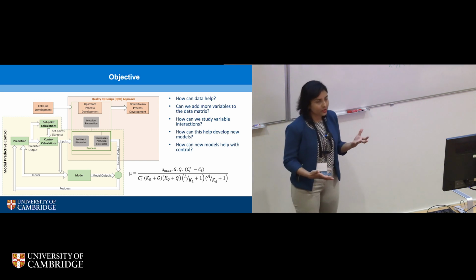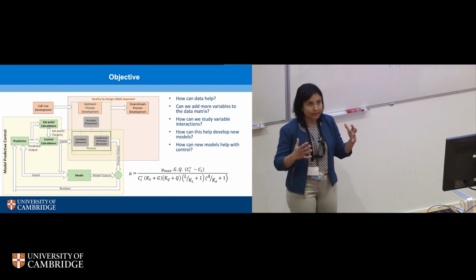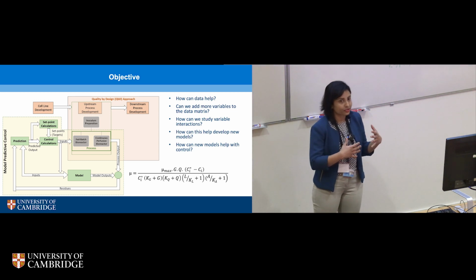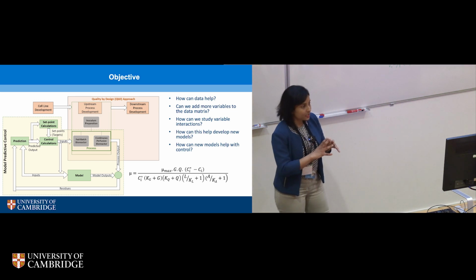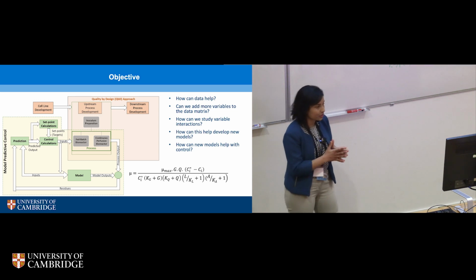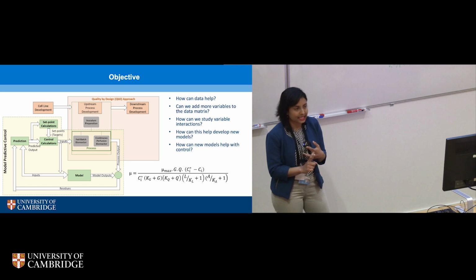This is not okay because if you're looking at a bioreactor, you need something that's more applicable in a heterogeneous situation, because we are growing different types of cells and different kinds of products. You need something that is applicable across the cell lines. Especially for CHO cell cultures, they generally use 4 different variables for control, which are glucose, glutamine, lactate, and ammonia.